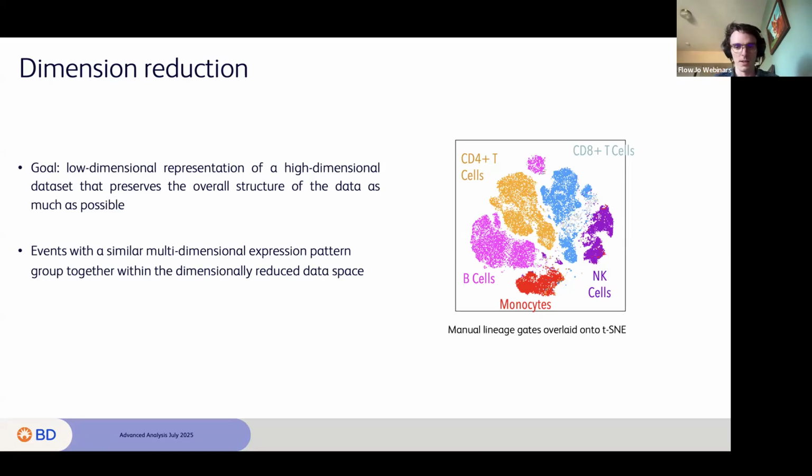And so within each phenotype, there are even more different subtypes that could be expressed. The machine learning sometimes can group the big phenotypes, but sometimes it'll also split them up based on those changes of naive versus memory or other substates.